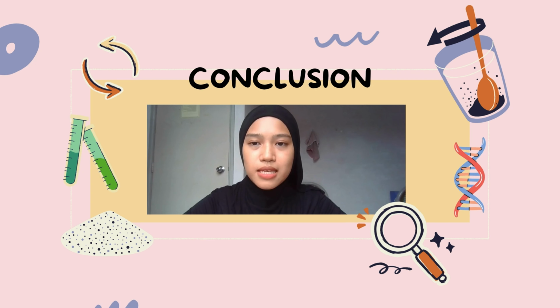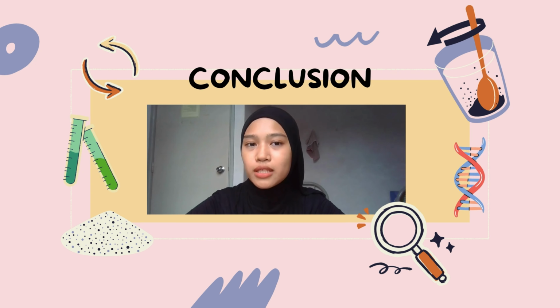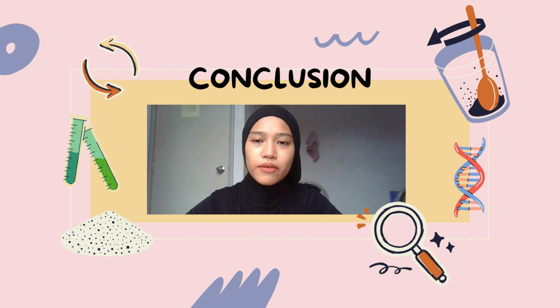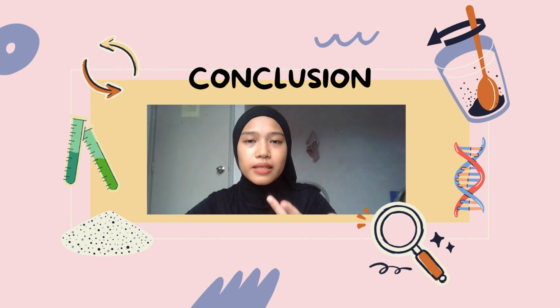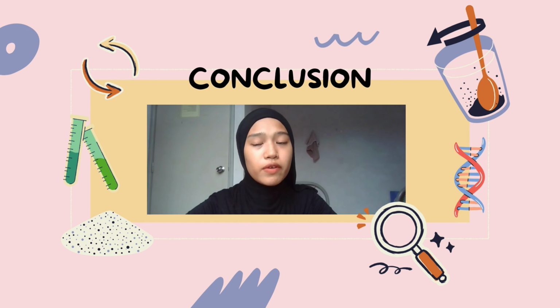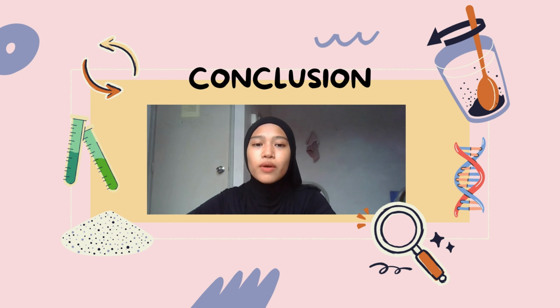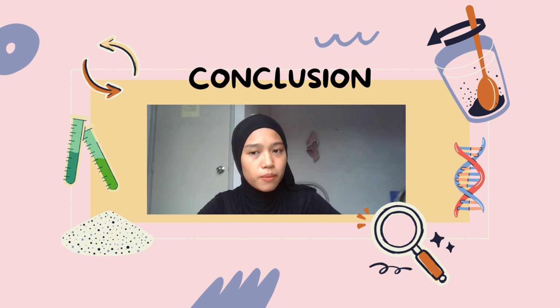So, to wrap all of this up, chromatography stands as a cornerstone in the food industry, ensuring that the food we consume is safe, high quality, and authentic. Through all of these techniques, we can detect pesticide residues, analyze food additives, determine nutritional content, monitor contaminants, authenticate products, and analyze flavor compounds. These powerful analytical methods help maintain stringent food safety standards, enhance nutritional accuracy, and verify the authenticity of various food products, from ensuring that fruits and vegetables are free from harmful pesticide residues to identifying the precise mix of flavors in gourmet chocolates.